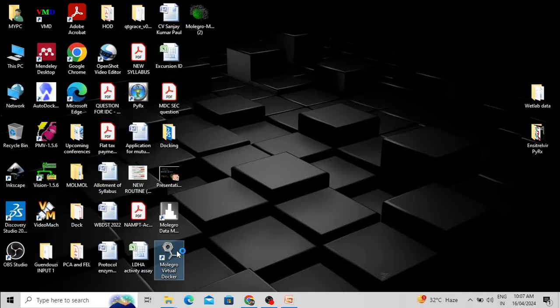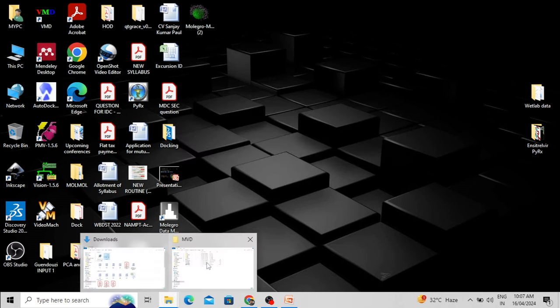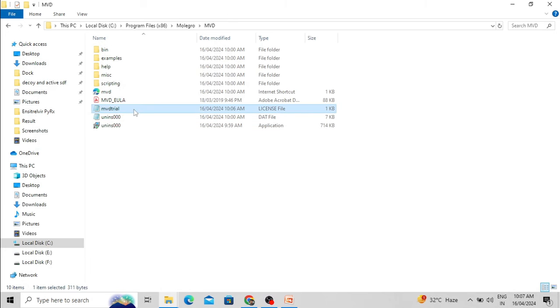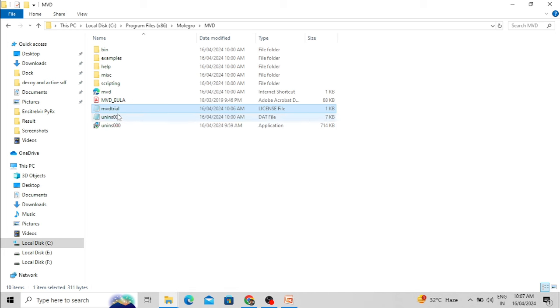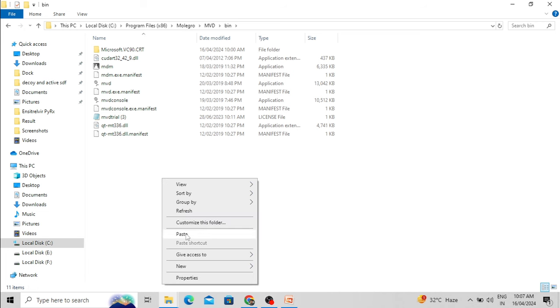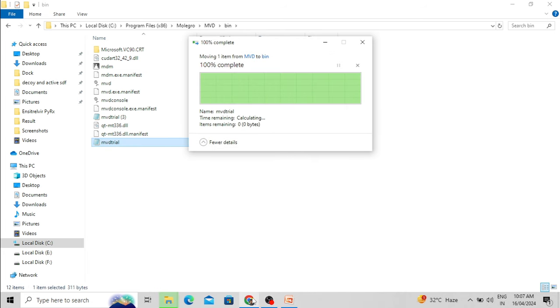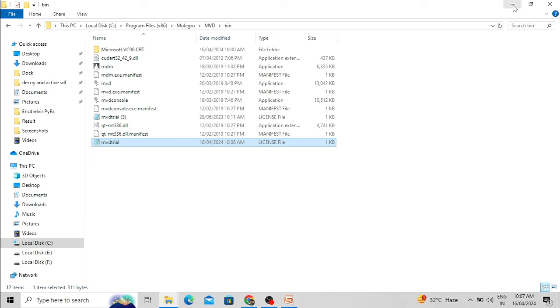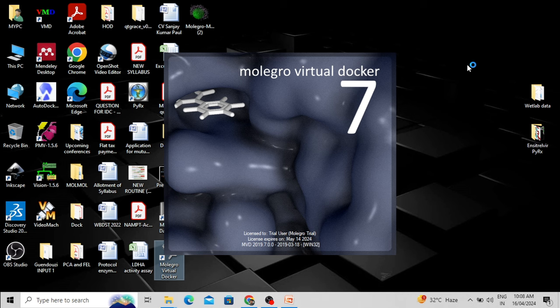Now again try to open. Sorry, we have to keep this trial license in the bin folder. Now let's see. Okay, now it's opening.